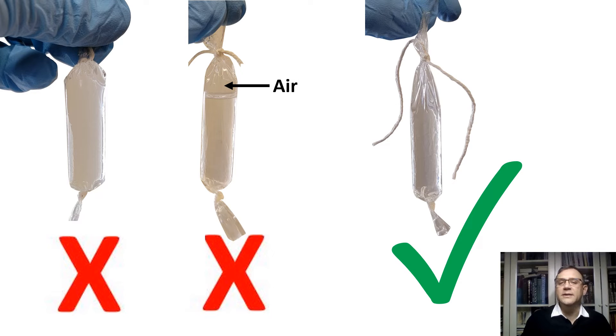Here is how our dialysis bag should look. There is no air inside, no bubble or bubbles, and the bag is loose, not too tight.